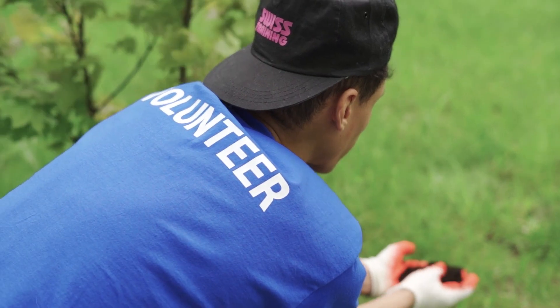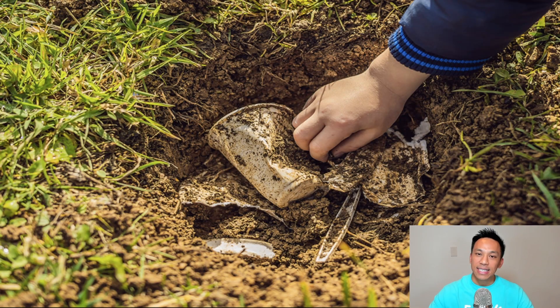People often ask, can biodegradable gloves be thrown in the trash? Yes, these gloves can be thrown in the trash and go to your standard landfill.